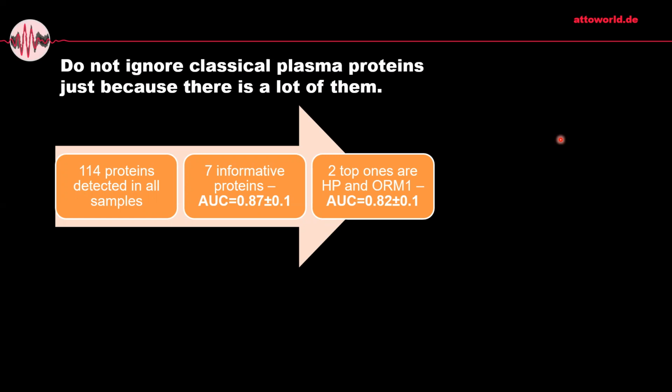These proteins are very much present in human plasma, among the 10 most abundant ones. So they are important, and combined, they are not used for lung cancer identification or screening. There are papers only on haptoglobin separately and alpha-1 acid glycoprotein separately.